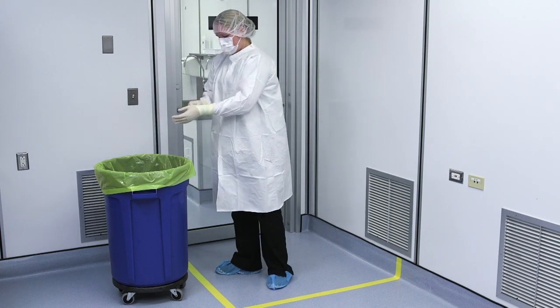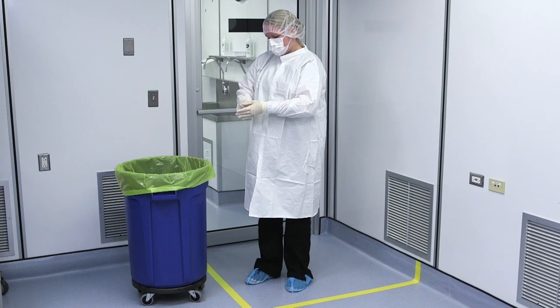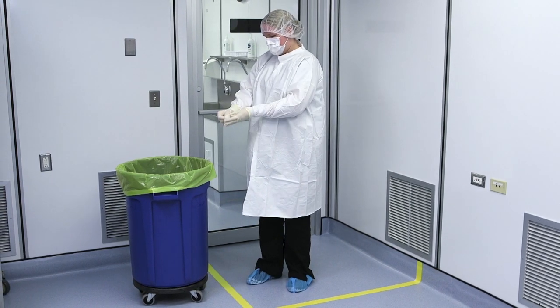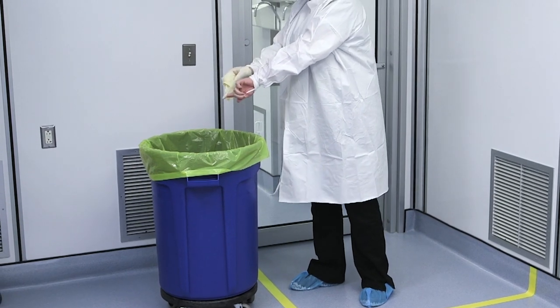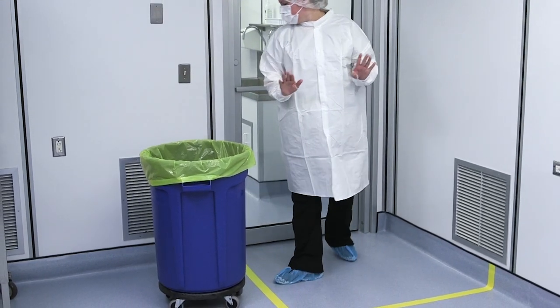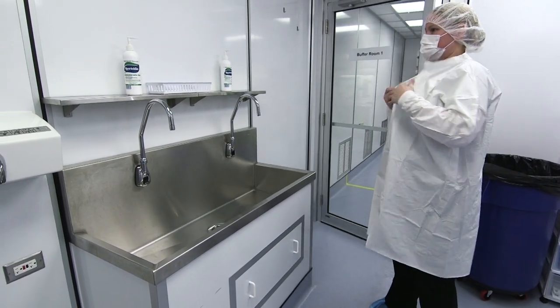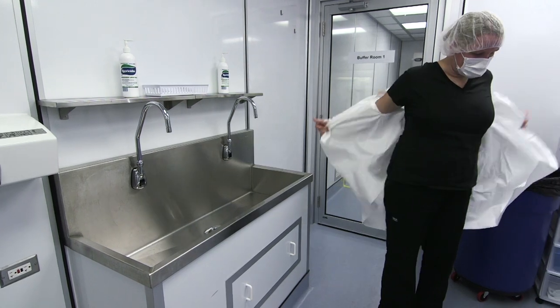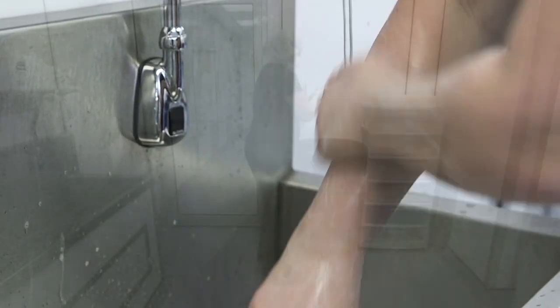Before leaving the HD buffer room, the worker must remove the remaining pair of gloves by pulling the first glove off without touching the wrists or skin, keeping the first glove in the palm of the still-gloved hand, then carefully slipping the forefinger of the bare hand underneath the cuff of the glove, removing the glove and making an inside-out packet of the gloves to discard. Next, exit the buffer room, remove the non-hazardous gown, perform hand hygiene with soap and water, and dry your hands.